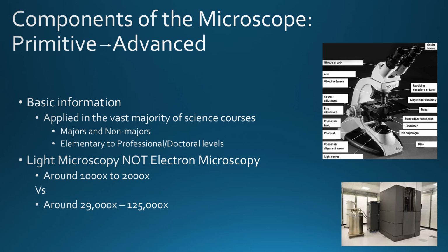There are scanning transmission electron microscopes and cryo-electron microscopes. Truthfully, at that magnification, you can probably see neurons in your brain firing, or protons and electrons, which are way, way smaller than the nucleus and the mitochondrion that we are able to see with a light microscope.